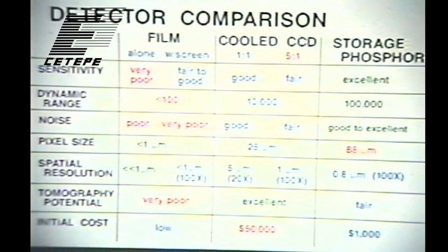So that's why you have to have this phosphor layer and convert it to light. But amorphous silicon is not crystalline, and so it's radiation hard, and you can shine the X-rays directly onto it. And so it's very, very efficient compared to this business of producing and focusing light.